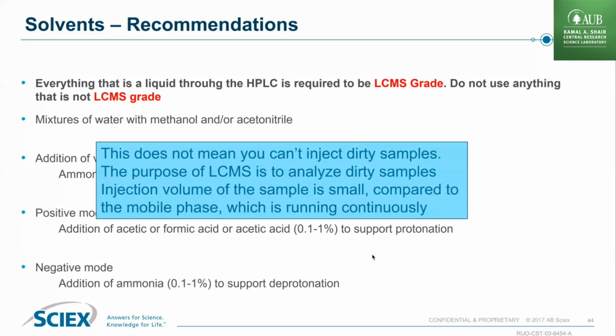So don't get confused that your samples need to be prepared with LCMS grade solvents. That's not true. Your samples are, of course, dirty. Dirty is a relative term, right? They are like a plant extract or a bacteria extract or something. We are just injecting a small amount of them into the continuously running mobile phase, and that continuously running mobile phase must be LCMS grade. So please follow this. This protects you. It makes your data analysis orders of magnitude easier, and it protects your investment in the instrument.